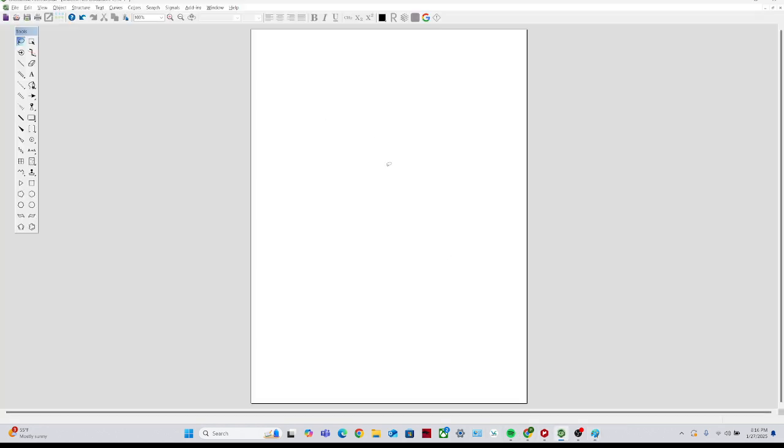I just draw my compound. So let me just make what I have here. Okay, this is the compound I have.